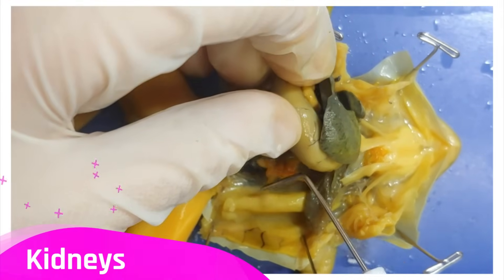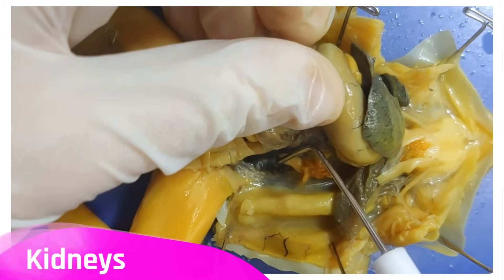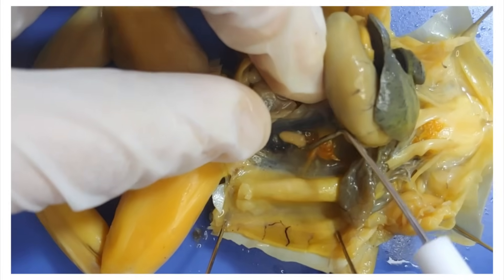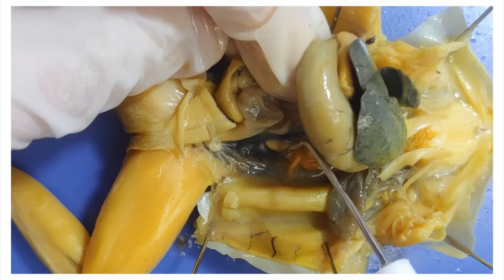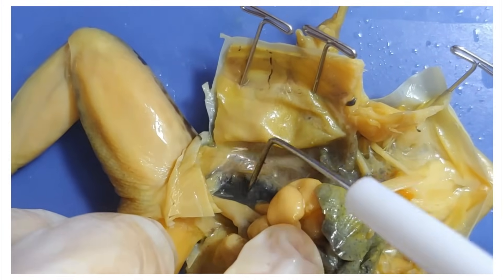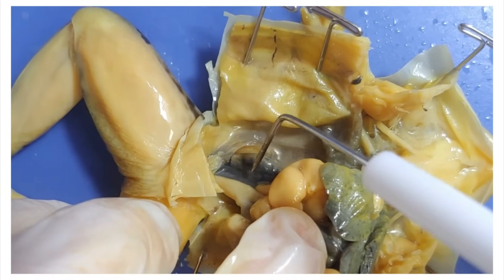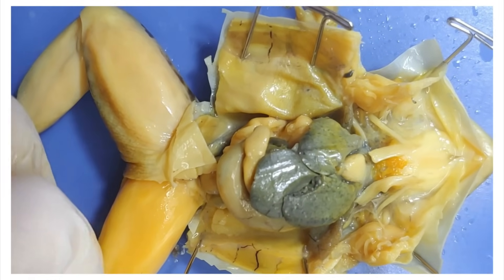A bit further down are the frog's kidneys — there's one here, but it's hard to see. I'm going to move to the other side. This one's much more visible. Good kidney. The kidney functions in filtering the blood to produce urine.